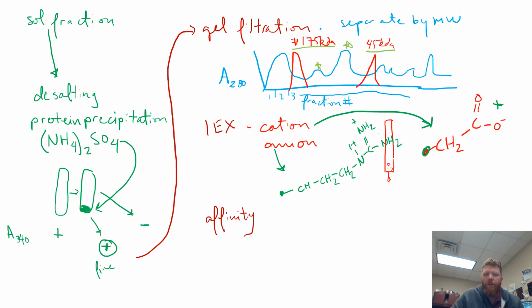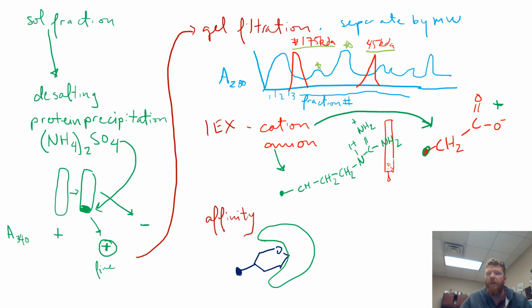An affinity chromatography column is basically the exact same, except you would have these small beads and something affixed to them permanently. For instance, what you could do is you could affix glucose to it. So then what happens is, or any sort of sugar, any hexose or pentose, well, any protein or any molecule that has an affinity for this glucose or this sugar is going to basically grab onto those and stay there until you do something to move them.